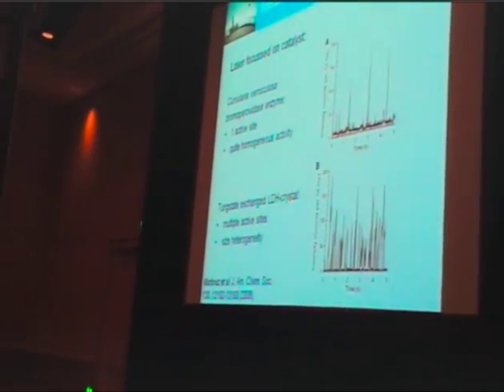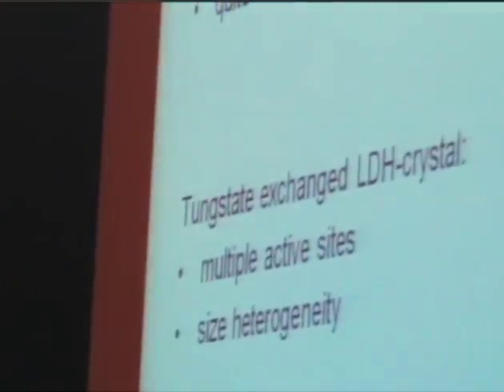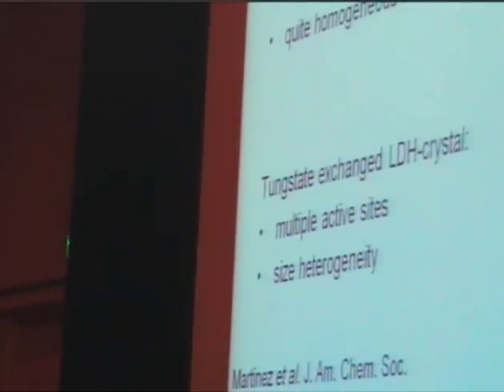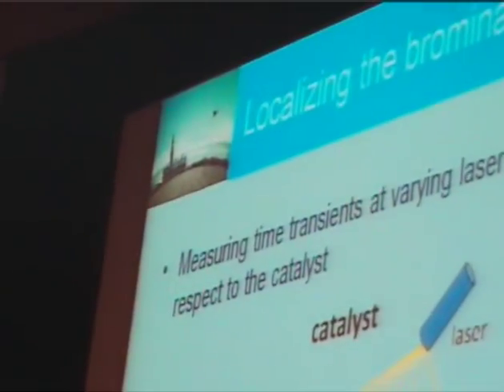And every burst here corresponds to one individual reaction event of this secondary reaction. So actually this is quite amazing. We can really see at which time one individual reaction is taking place there. Okay, as I said, we want to know where this reaction is mainly taking place.